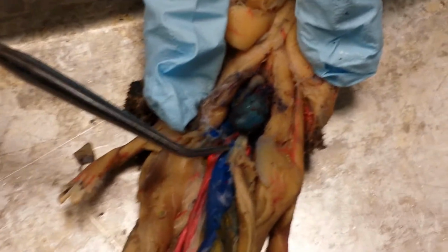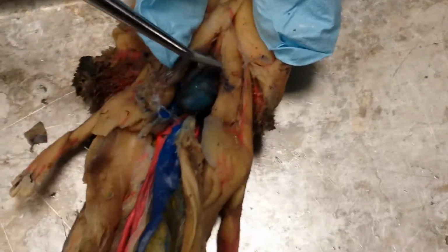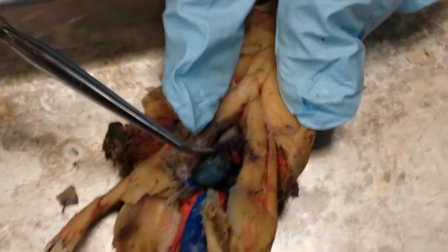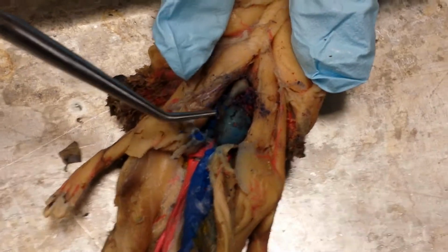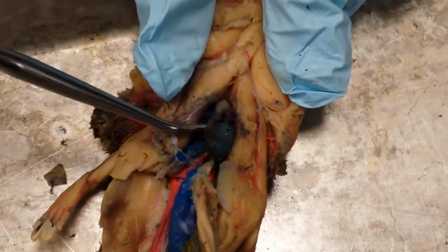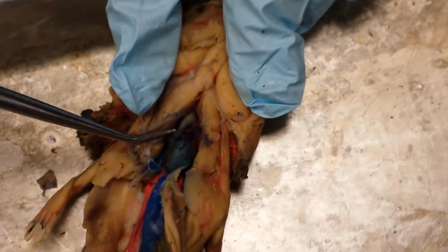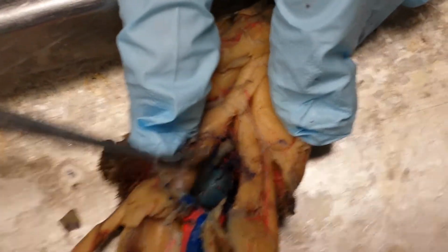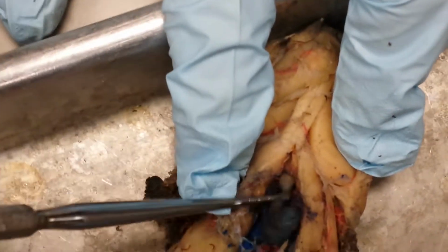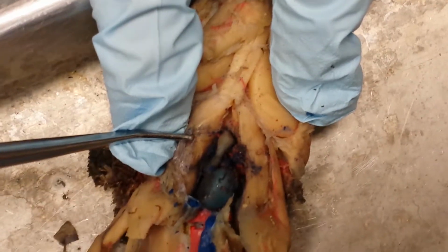From the ventricle, the blood's pumped into the lungs and the gills where it's oxygenated. Travels back to the left atrium of the heart, into the ventricle again, and then up out of the ventricle through this vessel right here. This is the conus arteriosus, just like in the shark. But you can see that as we move anterior, the conus changes diameter, kind of bulbs out right here. That's called the bulbous arteriosus.